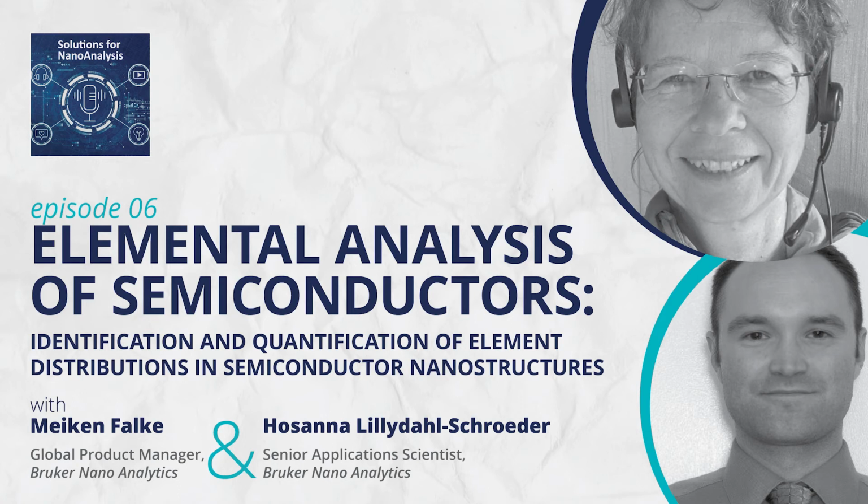Yeah, true. There are quite a few overlaps, but that's maybe one step ahead. I guess where the question also comes from is, formerly, using EDS for light elements was an absolute no-go. That's why it's not widely spread yet in life science, because formerly, in the lithium-drifted, liquid-nitrogen-cooled EDS era with beryllium windows, the detectors were not so efficient for the light elements, but they have become so good now.